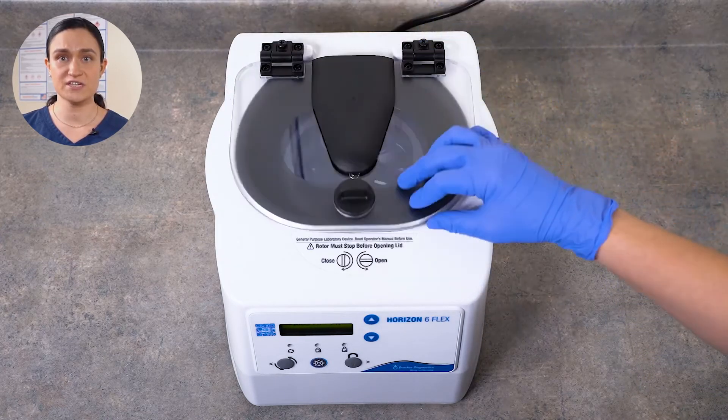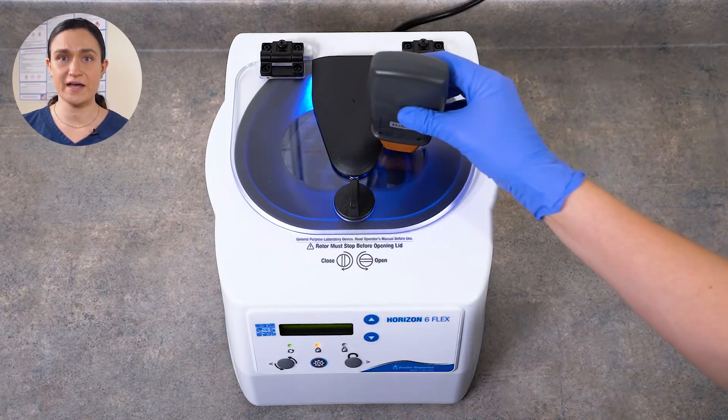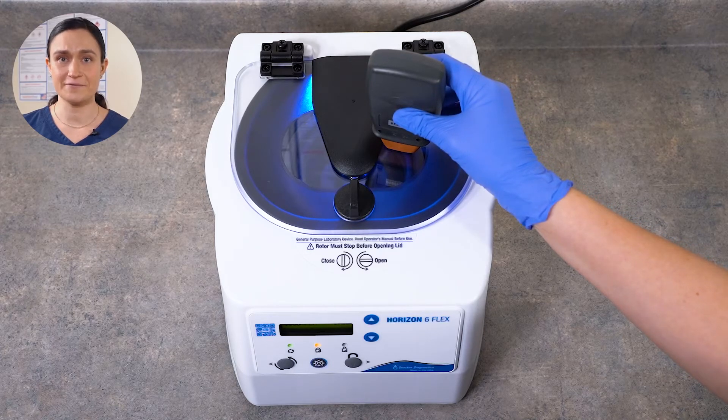Just start the cycle you wish to test, wait a minute or two for it to reach its peak speed, and point your photo tachometer down through the clear lid. You'll quickly get a reading.